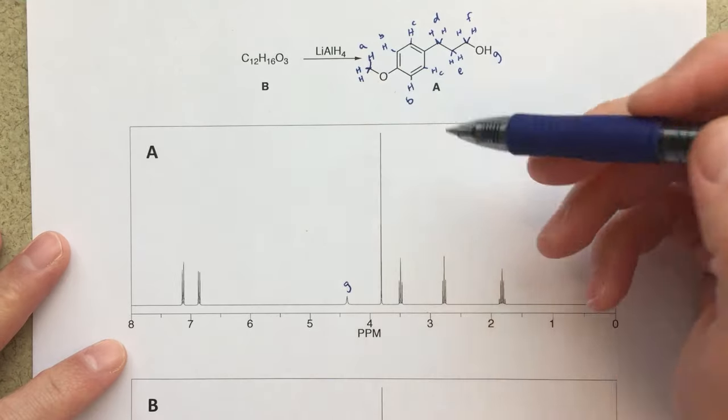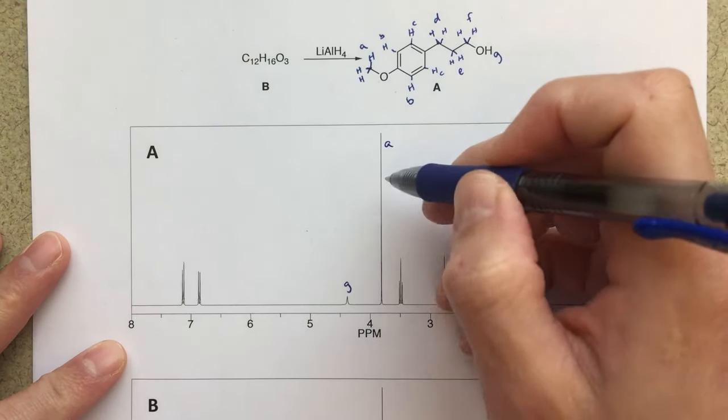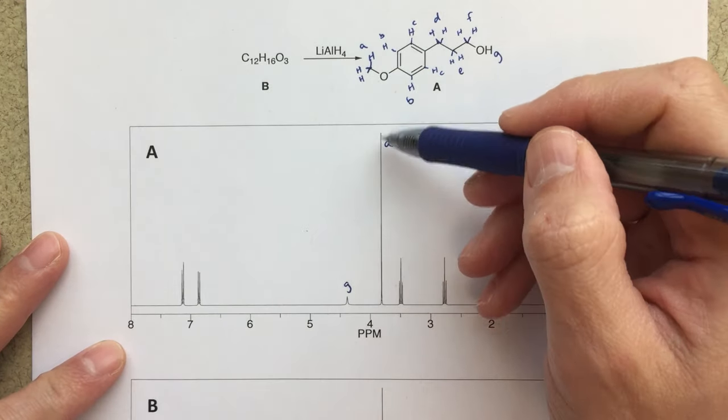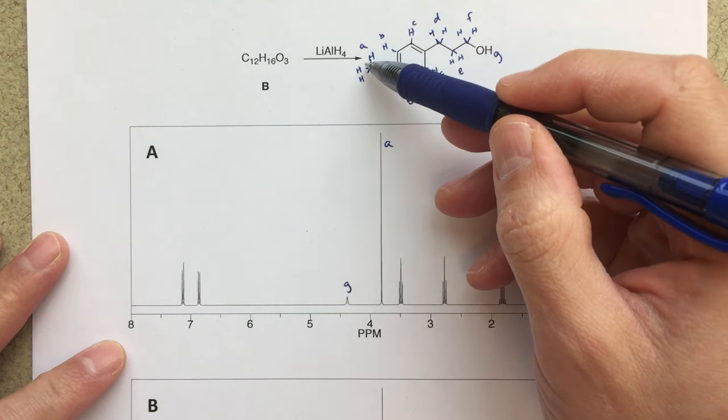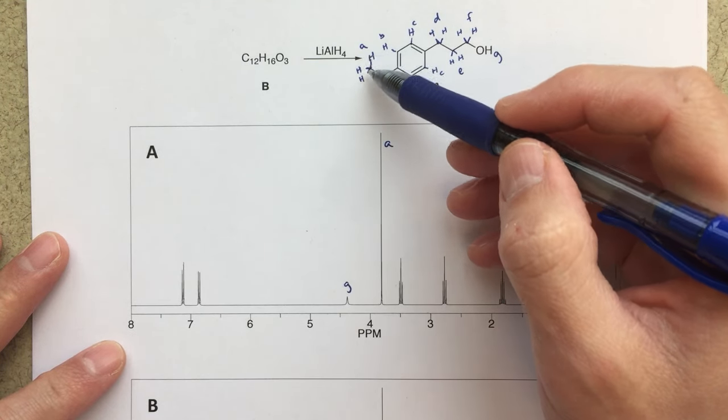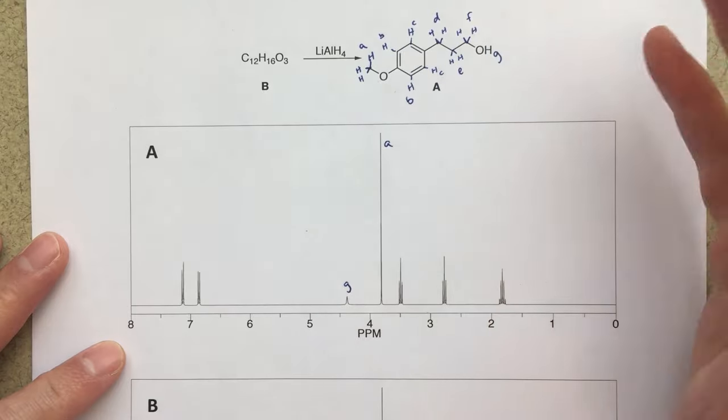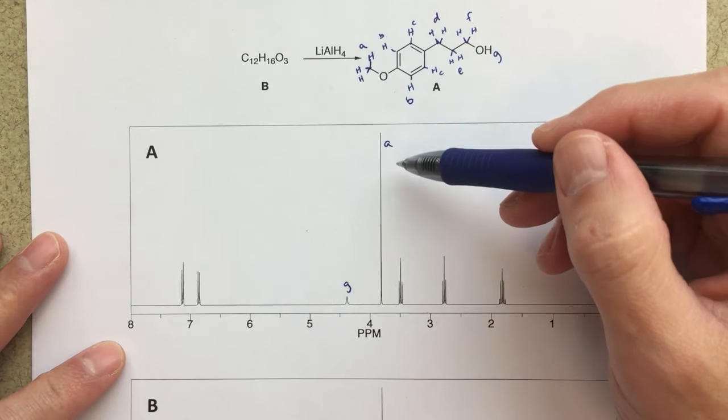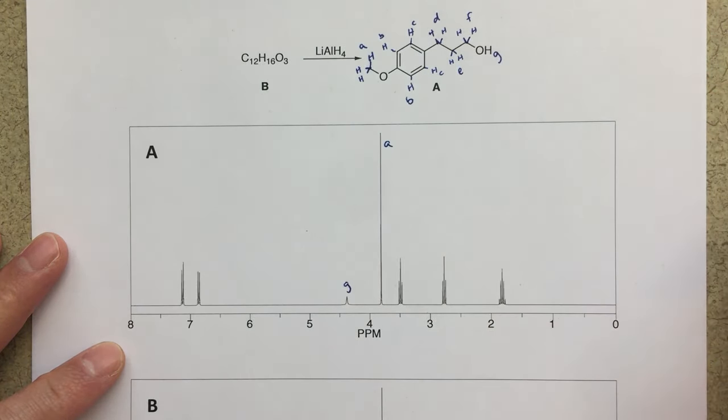Now our peak for A, I think it's very clearly this peak here. This is going to be a three H singlet, and we've got this methyl group or methoxy group, and these are going to be isolated, right? There's going to be no splitting, and they're going to integrate to three, so pretty clearly that's this peak here.